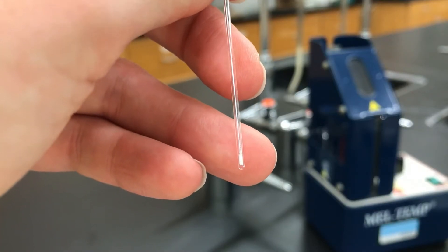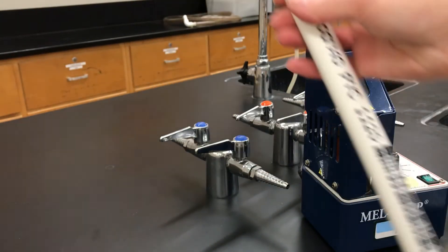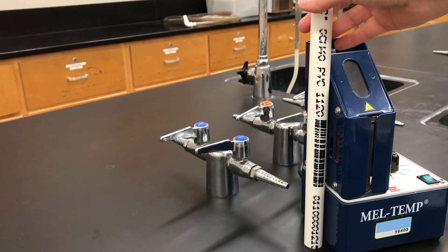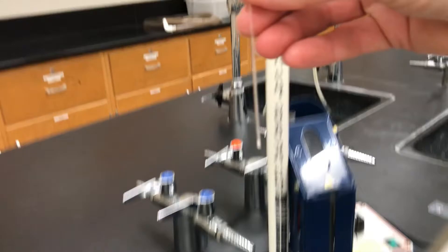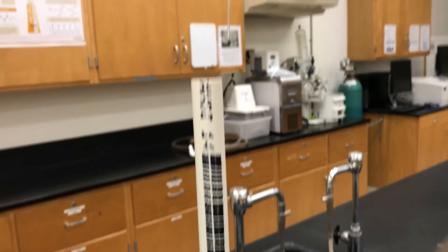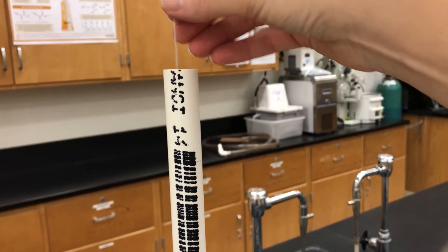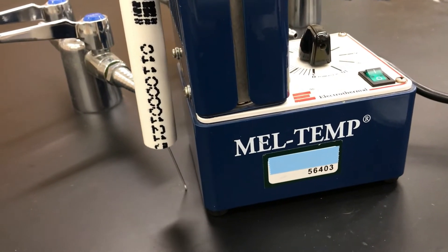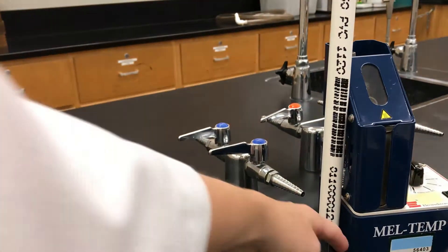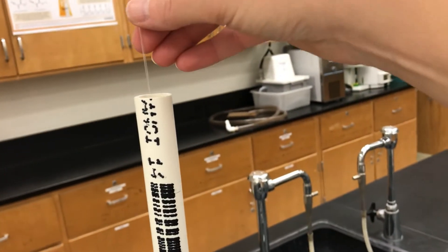You want that solid to be packed in the bottom of the tube. One thing you can do next is drop it inside of a PVC pipe or some sort of hollow tube. Drop it through the tube with the closed end down — when it hits the counter and bounces, that force is going to cause the solid to jostle and pack more tightly into the bottom of the tube. Drop it maybe twice and then it should be ready to go.